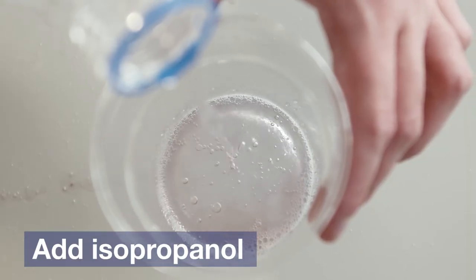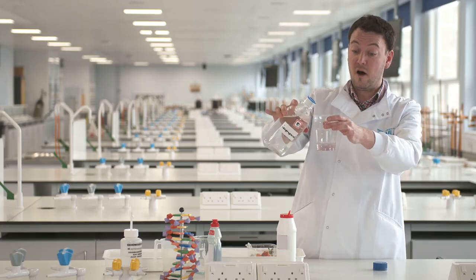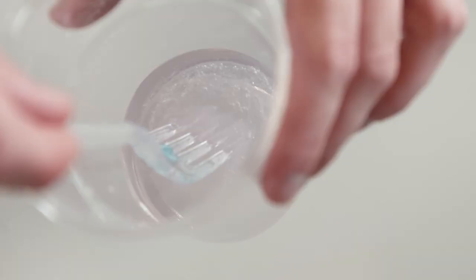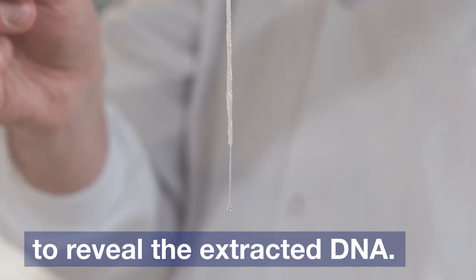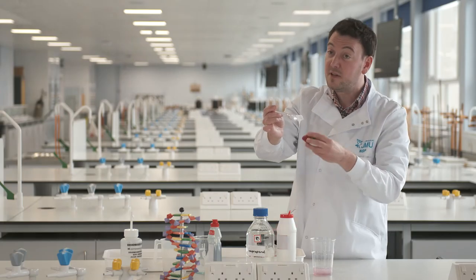When we add our isopropanol, our DNA should come alive before our very eyes. That is our DNA from strawberries — and that's all the components needed to make a delicious, lovely red strawberry.